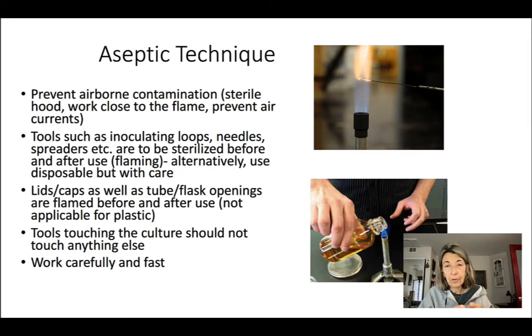In the biosafety simulation, in the aseptic technique simulation and in real life, often you'll be working close to a flame, a Bunsen burner. The reason is, one, because you will be sterilizing some of the tools and materials with the flame. And the second is because around the flame, because of the heat, there is going to be a cleaner, sterile zone. So in the simulation, they tell you to work close to the flame, and this is the reason.